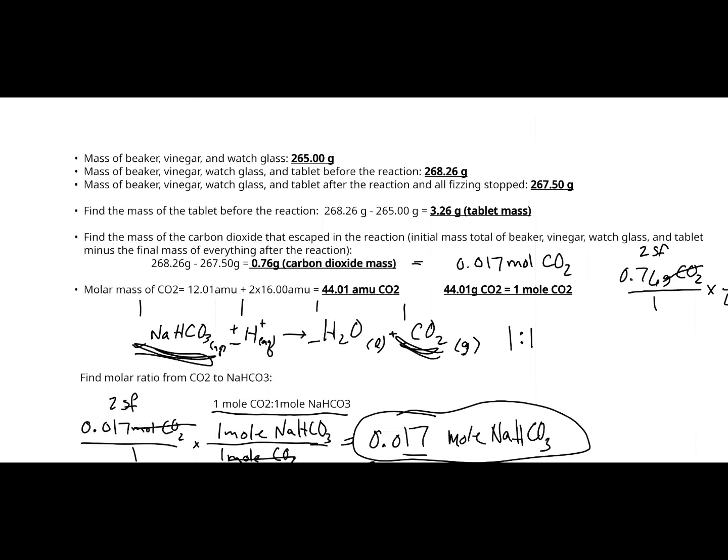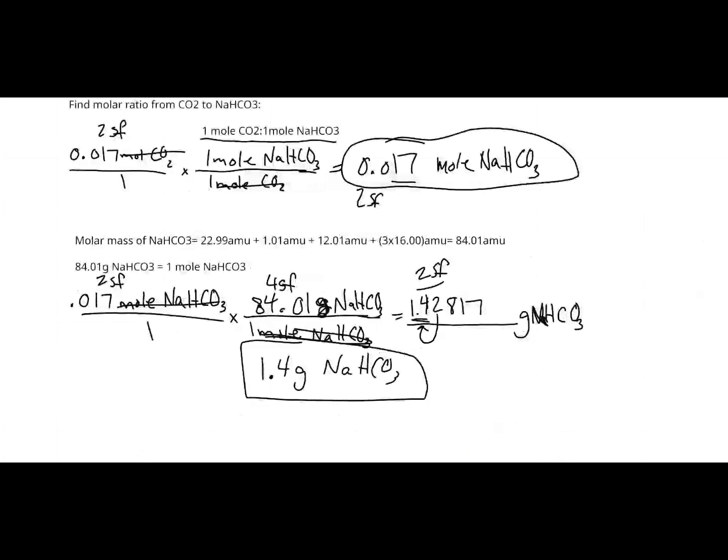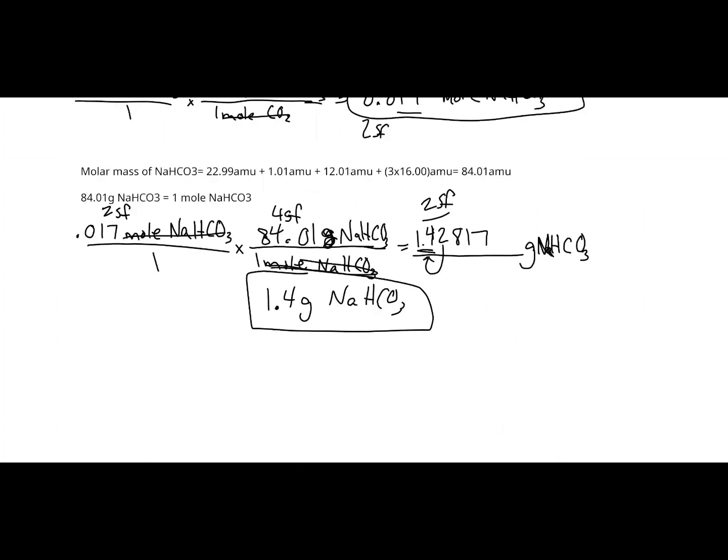We can see that we did indeed find the mass of the tablet right here, and it was 3.26 grams. So we are going to ask, how much is 1.4 of 3.26? We're going to find the percentage for that, so we are going to do some math. We said 3.26 grams was the mass of the whole tablet.